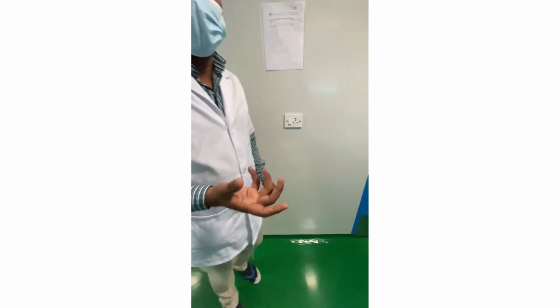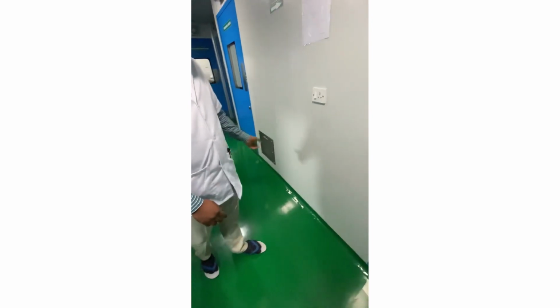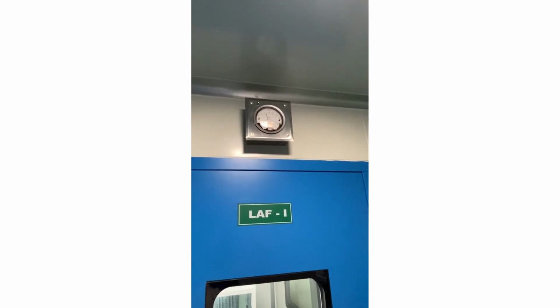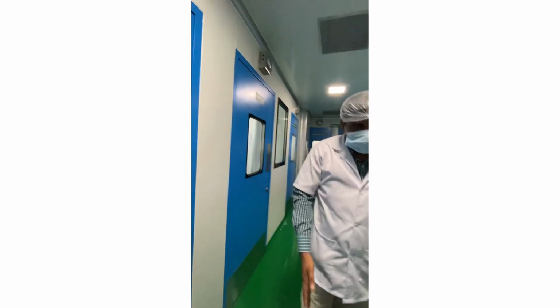We can't give blindly to the customer. Each and every room is pressure monitored, with positive pressure and negative pressure. This corridor is there.